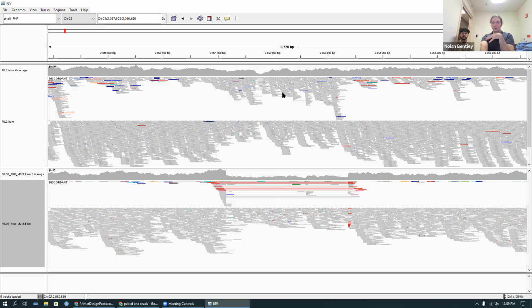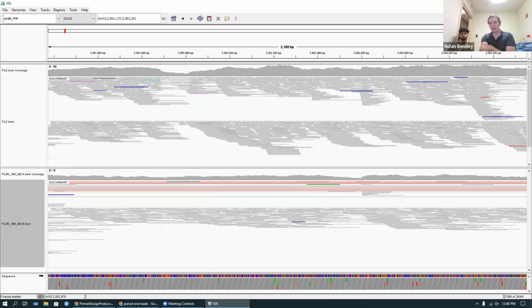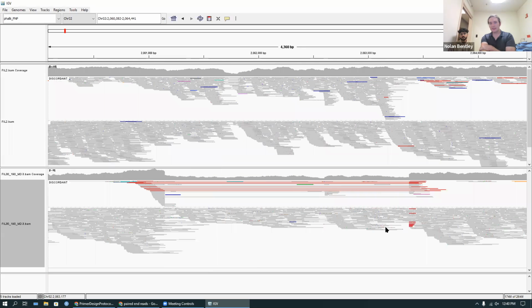All right, so there are some weird alignments that occur up here. They're discordant. I think they just match, there are just errors and stuff in them. But here there's an entirely new group of discordant sequences. And that's just because there was a deletion. But now, actually understanding the deletion better can be tricky.